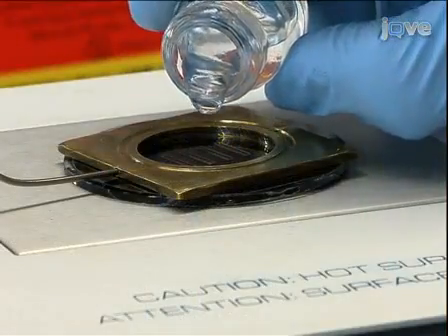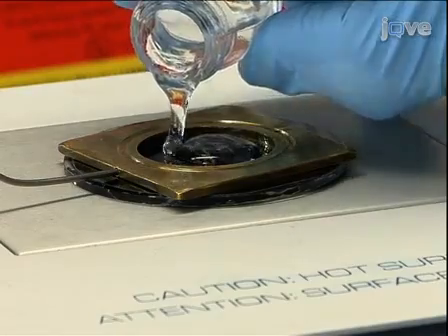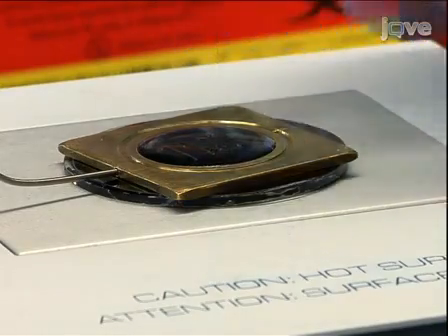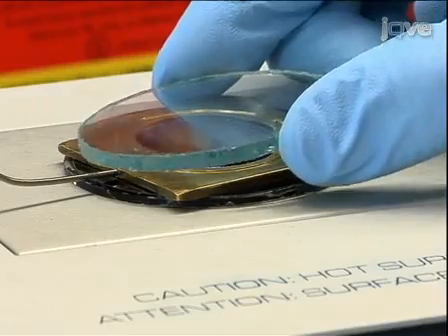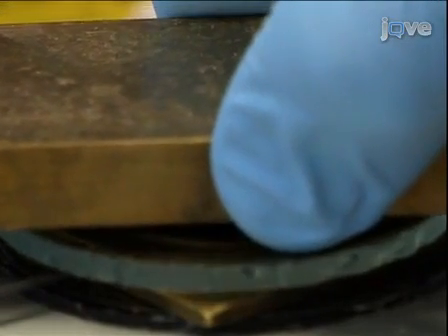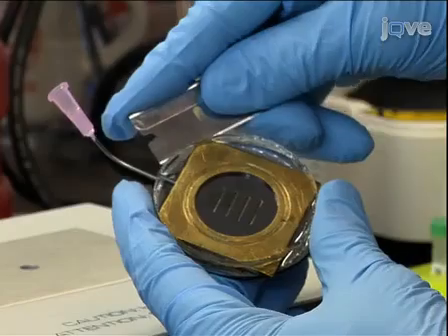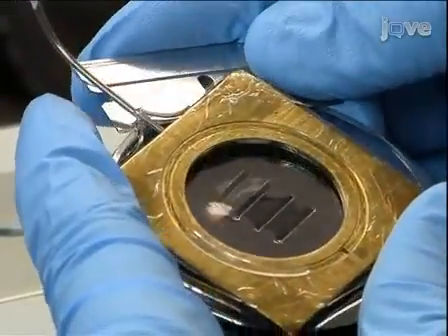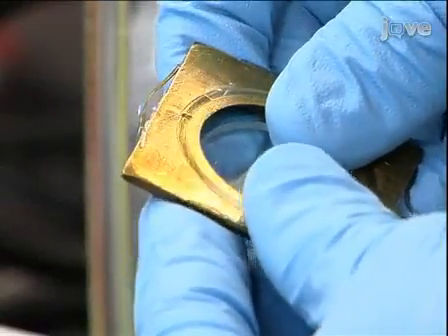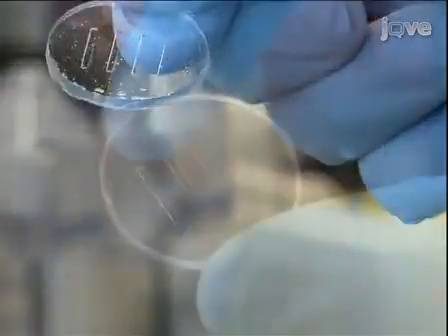After the elastomer base has been degassed, pour it gently into the microfluidic cell mold. Leave the elastomer mix to cure on a hot plate at 70 degrees Celsius for 2 hours. When cured, carefully peel the PDMS disc off from the mold using a razor blade. The PDMS disc contains 4 30 microliter rectangular chambers.